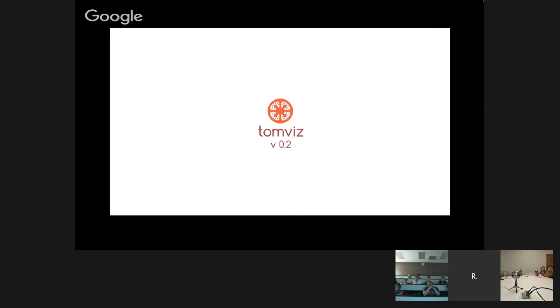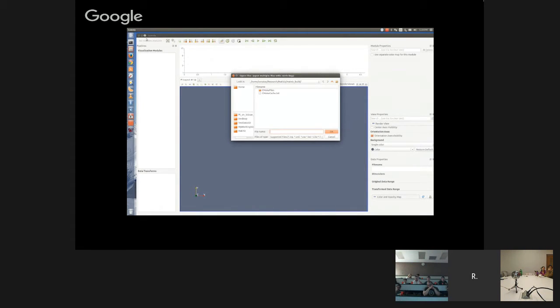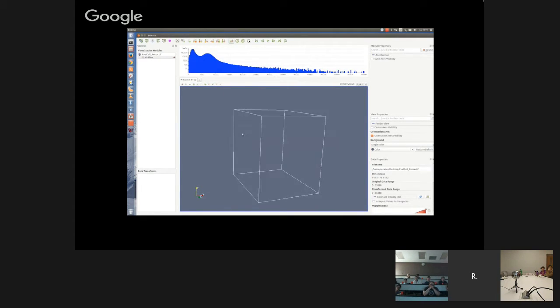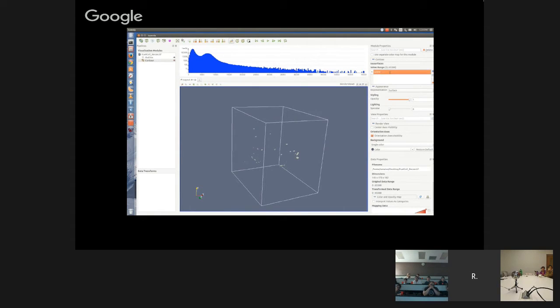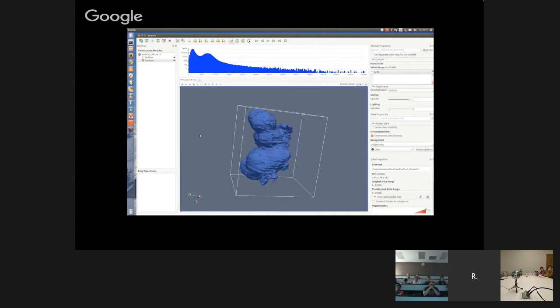Again, this is a tool you can start playing with any volumetric data set. So a stack of images, or a stack of images you take on your iPhone, or with your light microscope, you could load into it, or a simulation that has 3-dimensional volumetric data. It comes with some sample data sets that you can use, but this is just another catalyst data set.